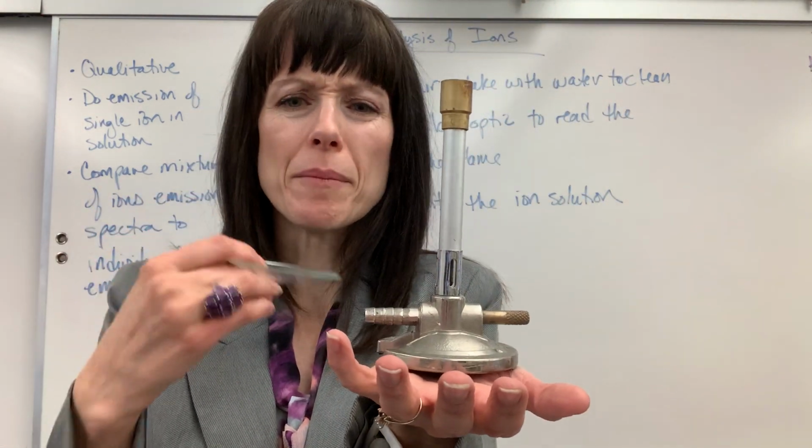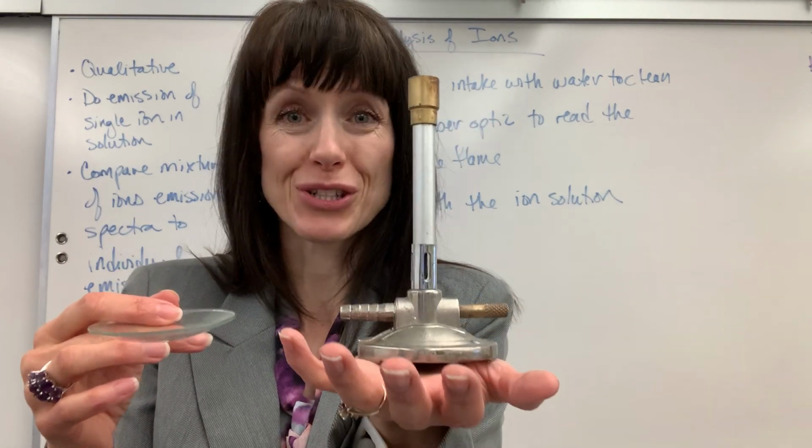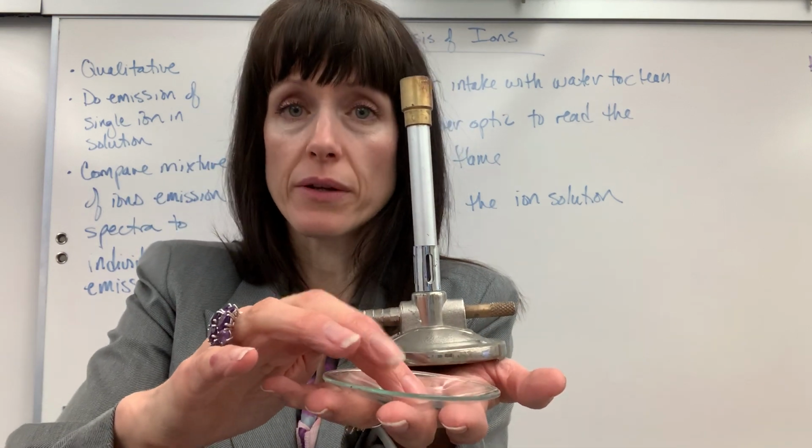Remember, this is all sitting on the bench, okay? I'm not by any means touching this. This is all sitting on the bench. I'm just showing you this. Okay, so I put just a small amount of solution of sodium nitrate in here.